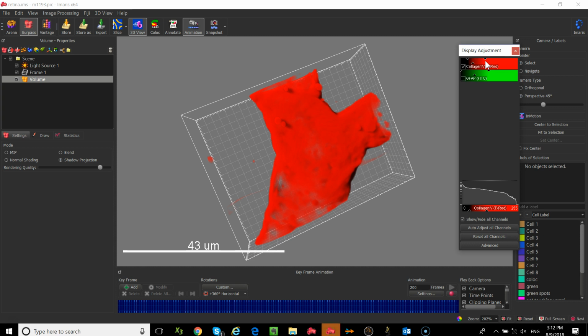This technique is really here for those people who want to get a good snapshot for a poster or a publication. It's not really designed to be an interactive preview. So if you want interactivity, use one of the other modes that we provide. Okay?